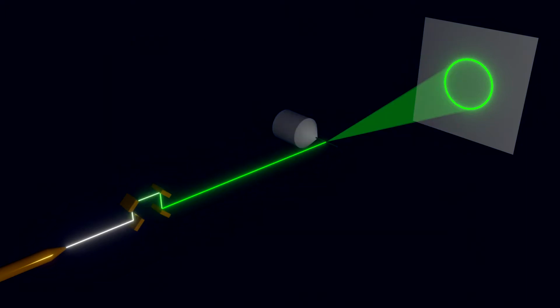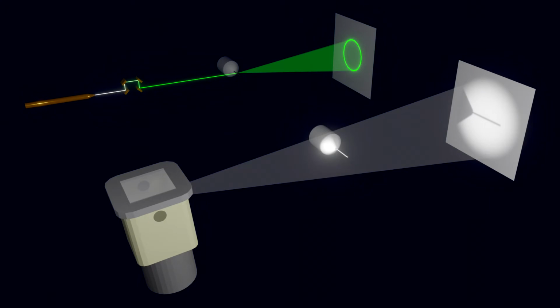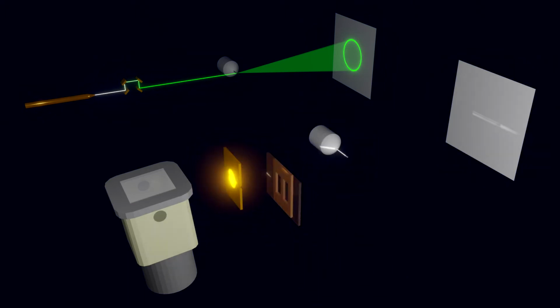Now let's compare this to a conventional capillary instrument as we can configure it in Profex. The beam coming from the tube's target, which is also called focus in BGMN, is divergent and has a nearly monochromatic characteristic spectrum. If there were no apertures limiting the beam diameter, the primary beam would hit the detector and vastly overpower the diffraction signal. So we limit the footprint using a divergence slit for the equatorial beam height and the beam mask for the axial width. Now we can only see the primary beam as a narrow line on the detector with the shadow of the capillary in the center.